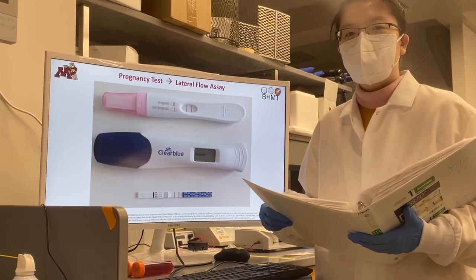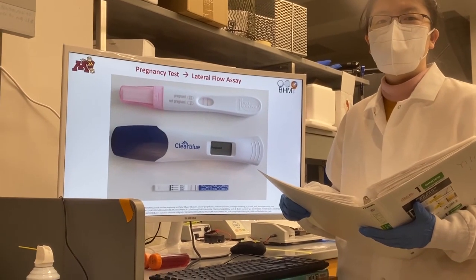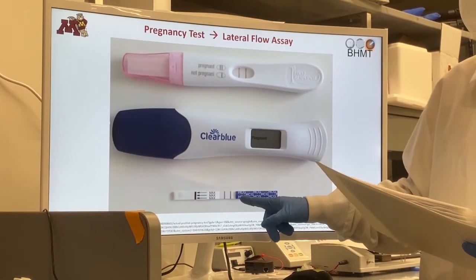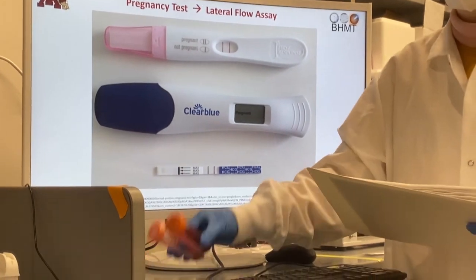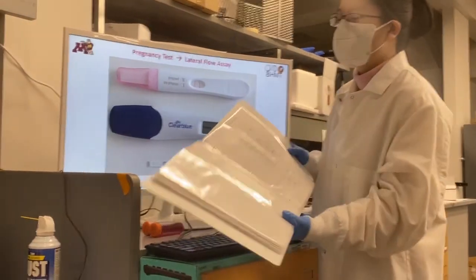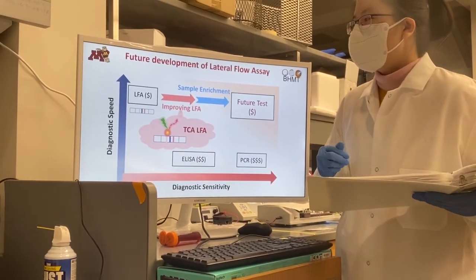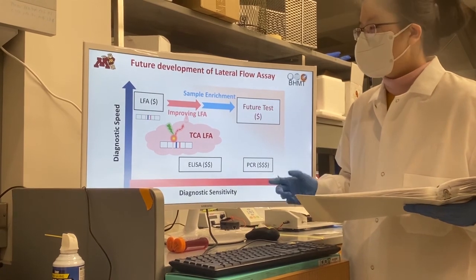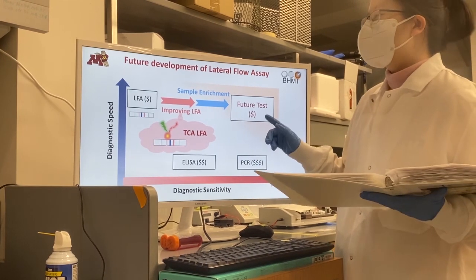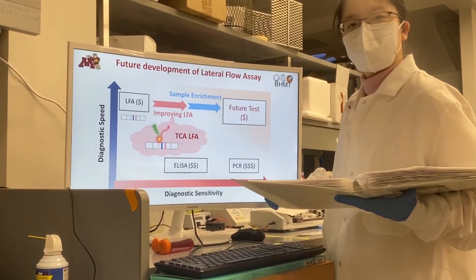Hi everyone, I will introduce the rapid diagnostic project in Bischof Lab. Probably the most familiar application is the pregnancy test. Our lab synthesizes those test strips in our wet chemistry lab, and we synthesize colloidal gold as labels, and develop those strips for improved assay performance. And hopefully, with this assay improvement and signal amplification by thermal contrast amplification, we would like to achieve future point-of-care tests that are cheap, rapid, and highly sensitive.